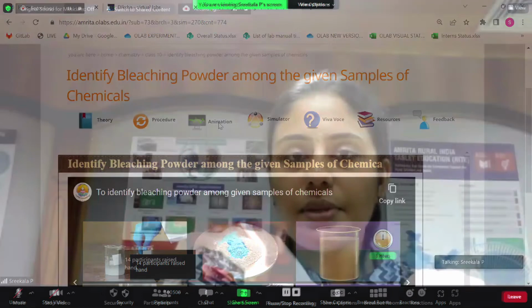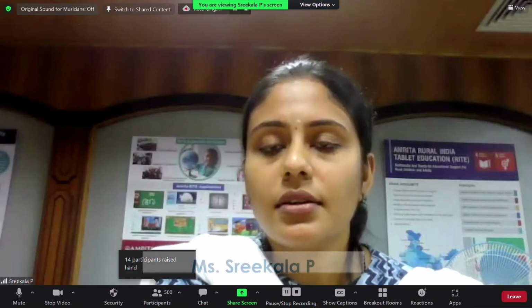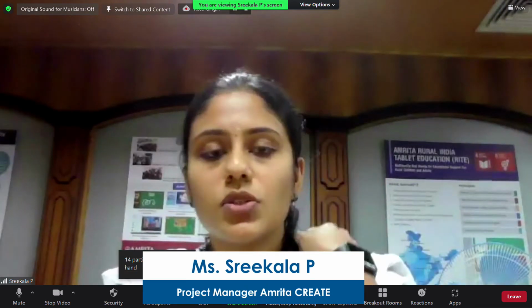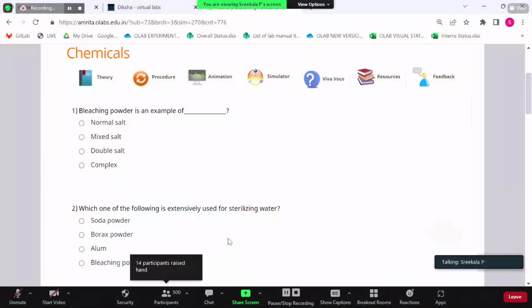Hope the animation tab is clear for you. Now let's move to the Viva Voce tab. So after performing the experiment, the student can do a self-assessment of their knowledge levels of this particular experiment by attempting these Viva questions.